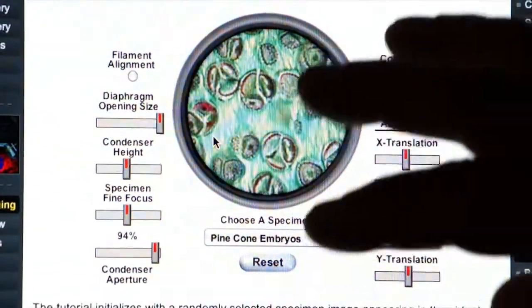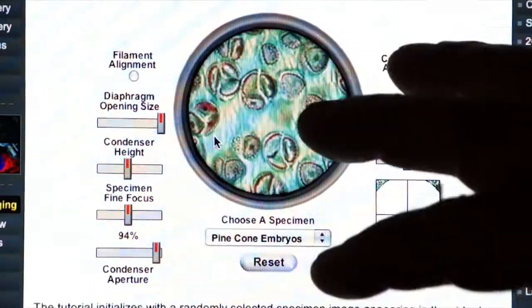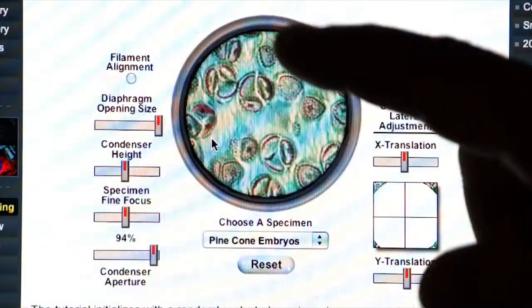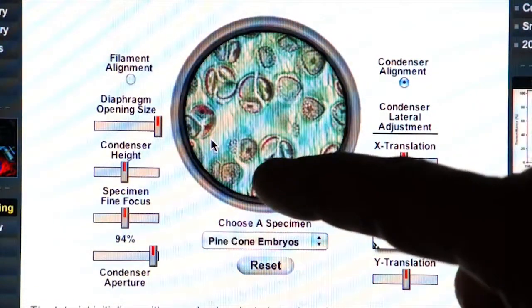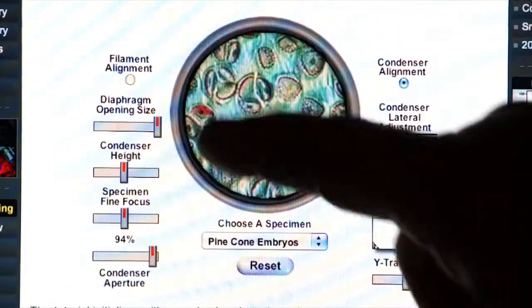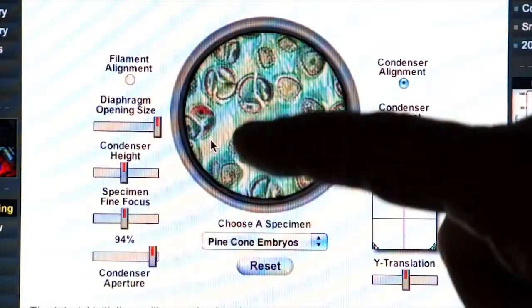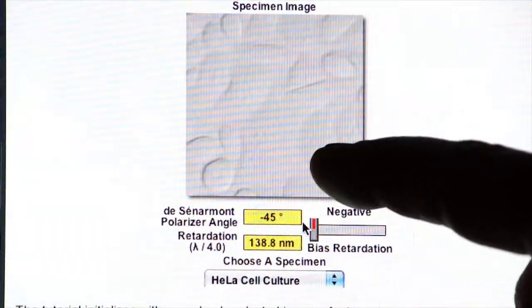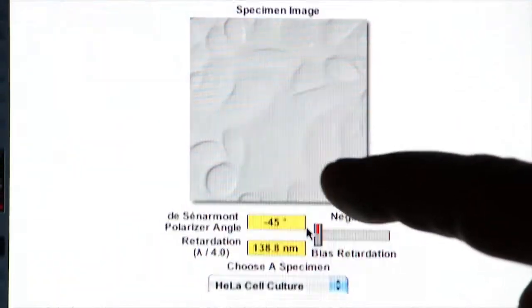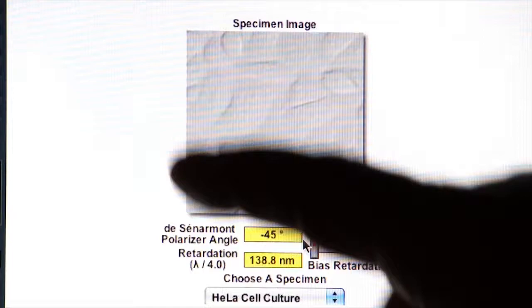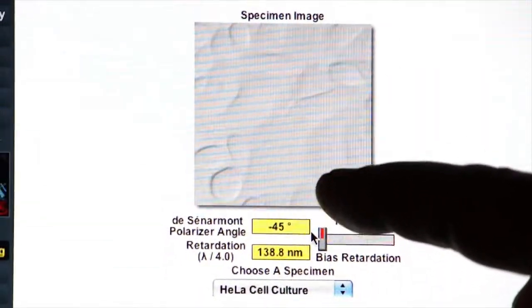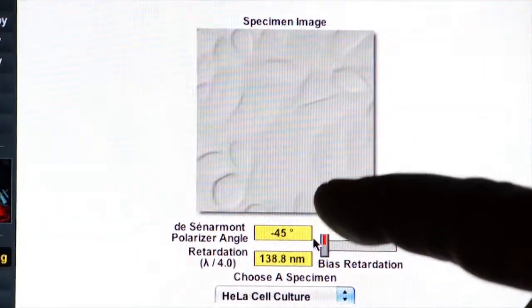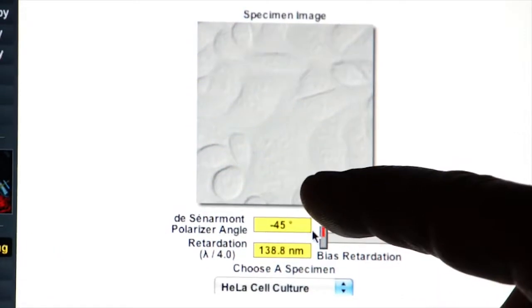There are three modes of illumination that we use for transmitted light in the Leica confocal microscope. The first one is bright field — simply light passing through your specimen, which in this case is stained. If you're looking at live cells which have been cultured in bright field, they might not show much detail. So bright field is not the preferred transmitted light technique for looking at living cells.